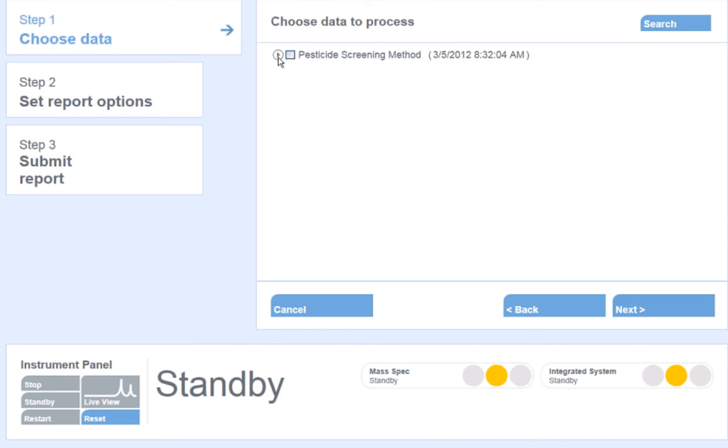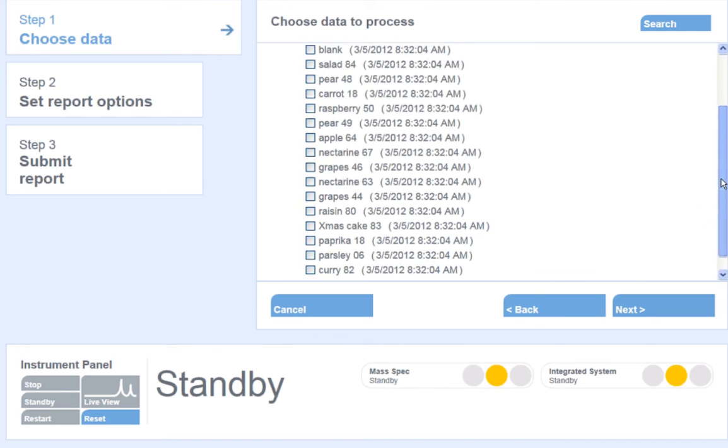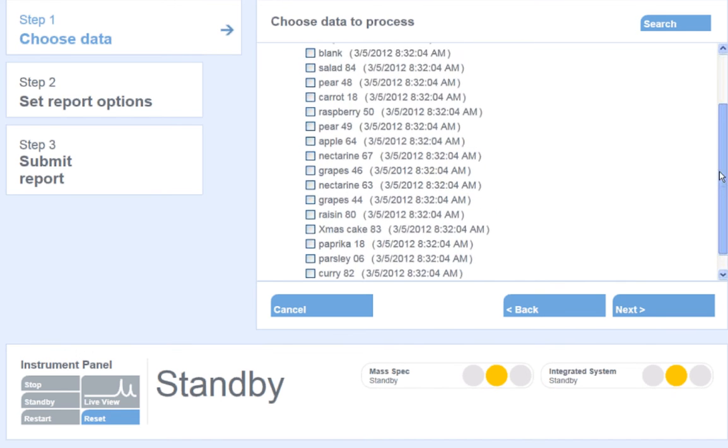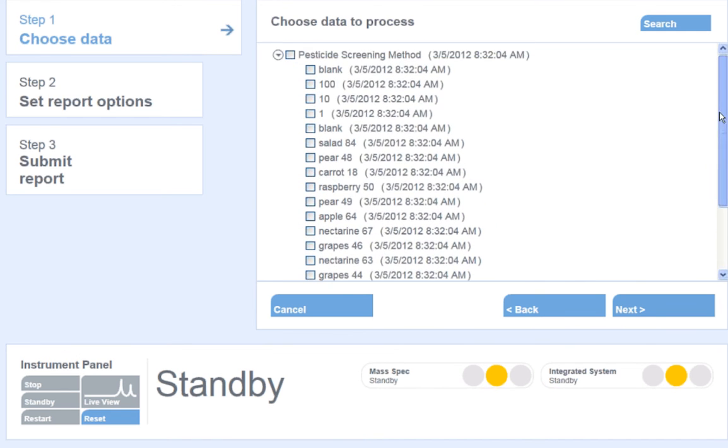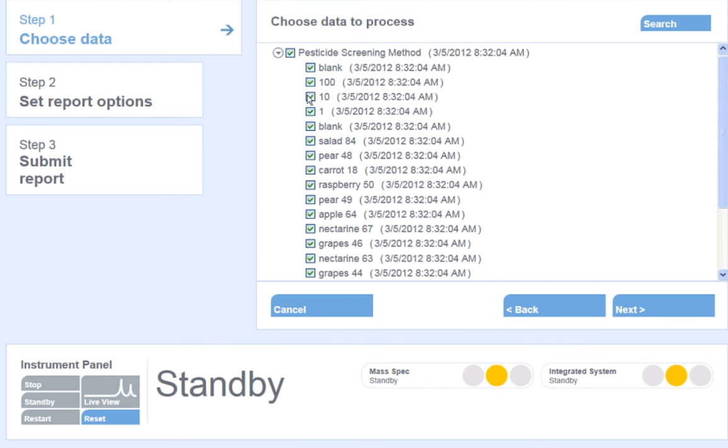Select the data set to reprocess. Clicking the arrow to the left of the sample batch name shows all of the samples that were collected within that batch of samples. You can choose to process as many of the samples as required by checking the box to the left of the sample name. Checking the box to the left of the batch name will reprocess all of the samples collected in that batch.